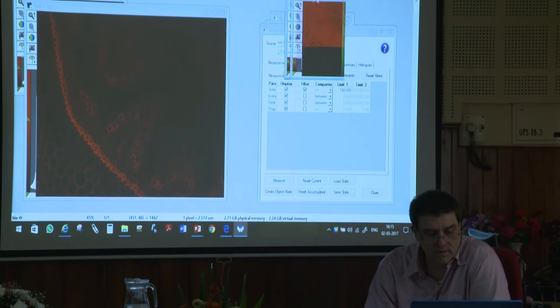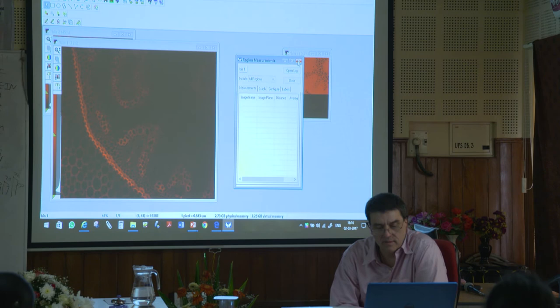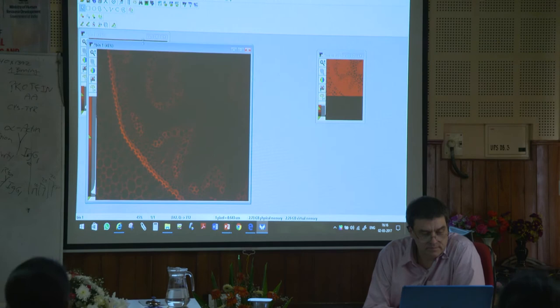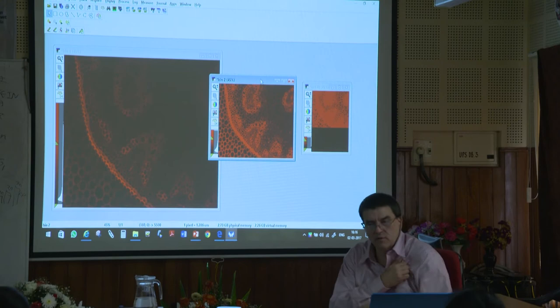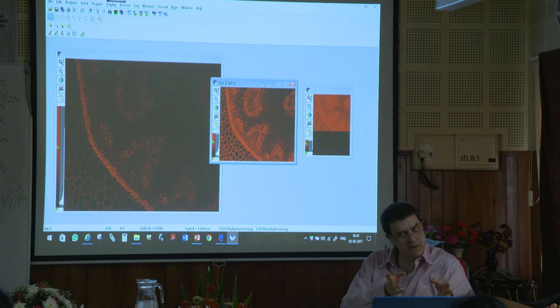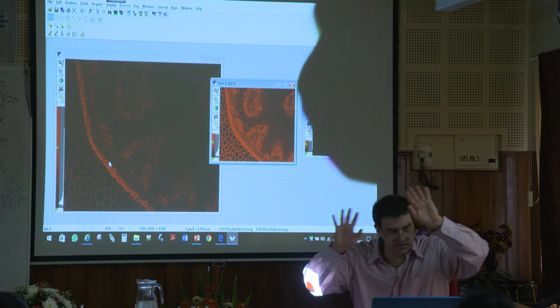Okay, so I've got these three images. I took these on my camera before I left Cleveland because I wanted to talk to you about binning. And we talked about binning a little bit ago, right? So if I want to be fair, and I want to compare these three images, and I want to make sure that I'm looking at them apples to apples, like we said. I don't know if you use that expression here, but everybody seems to understand what I meant, right? I want to be fair. Maybe you use mangoes to mangoes. I don't know. But anyway, what do I have to do to make sure these are equal in intensity, so I'm not fooling myself? What do I have to do?